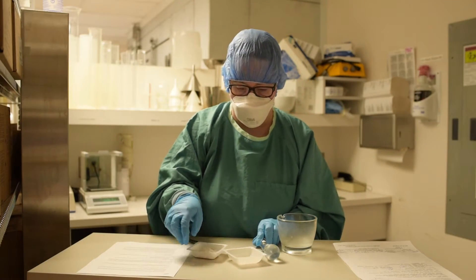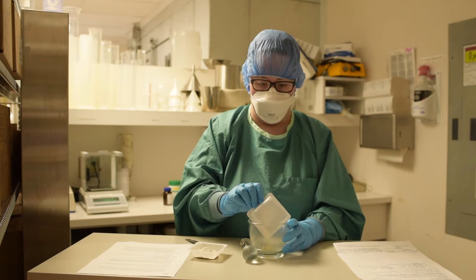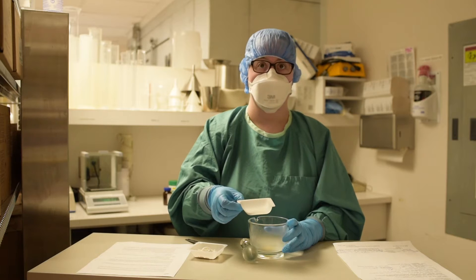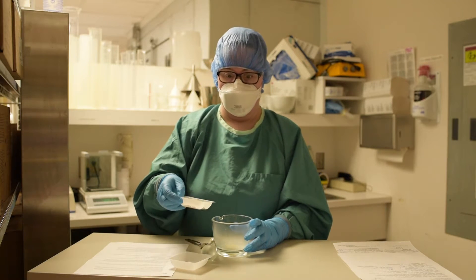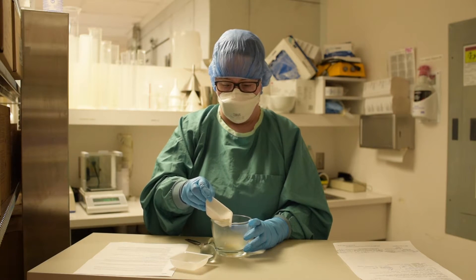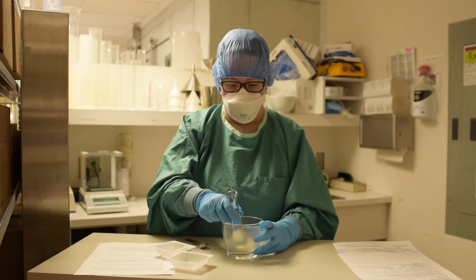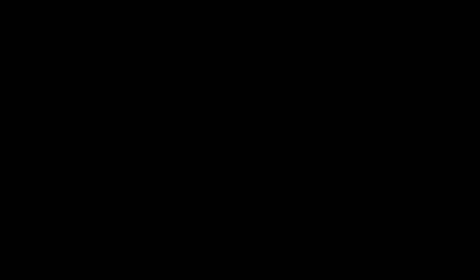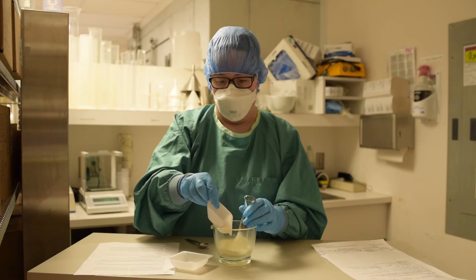In this scene, the technician has garbed properly using proper personal protective equipment. As well, we are going to show geometric dilution, whereby a small amount of drug with a large amount of another ingredient or diluent is mixed. This method allows for thoroughly mixing a small amount of drug with a diluent to create an equal distribution of active ingredient in a compound, creating a homogeneous mixture.